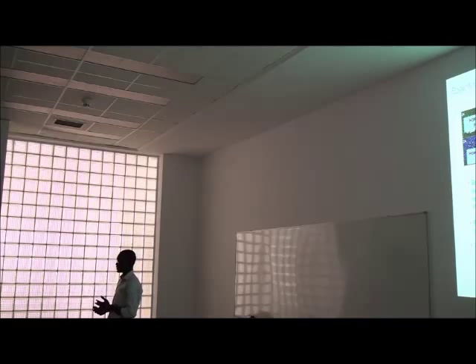So for instance, I have a customer who is working on primary neurons, and he's only using a MAP2 staining, and he's only looking at the synapses in neurons. So in this case, you first have to find all the nuclei, find cell bodies, decide whether this cell body is mature or not, and then trace the neurites, expand the neurites, find the spots inside, classify the spots, this is a good spot, this is not a good spot, and then make the decision at the end. And you can also trace neurites not attached to cell bodies, because I have written a script for that.